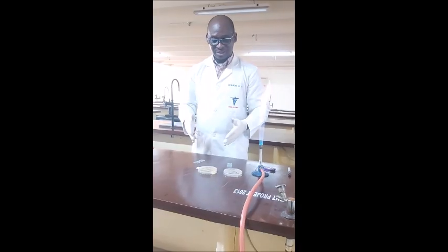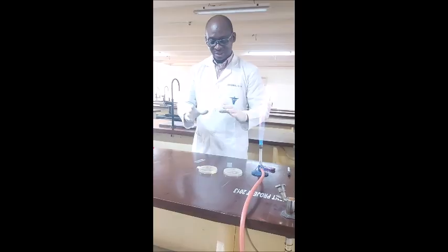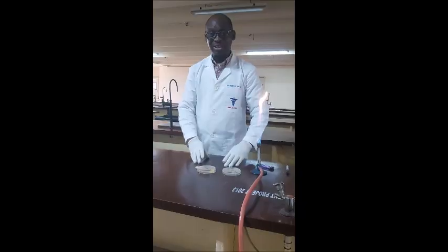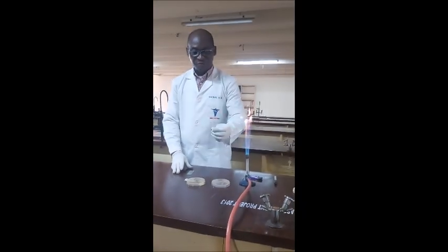Gram stain is a technique that was invented by a Dutch scientist. The Gram stain we are talking about here is the same Gram stain they use in many other universities all over the world.